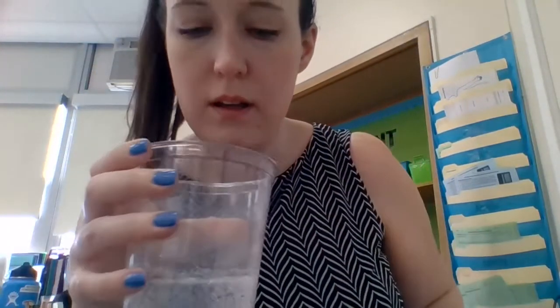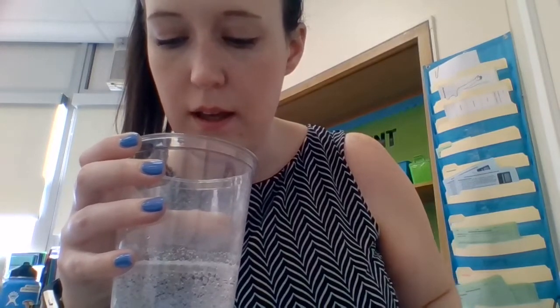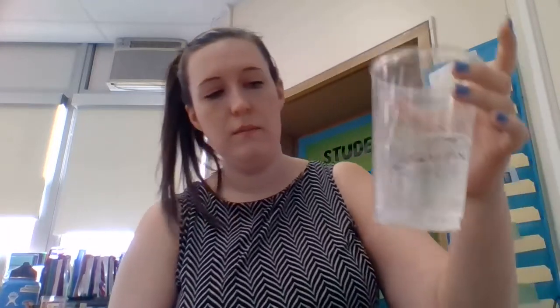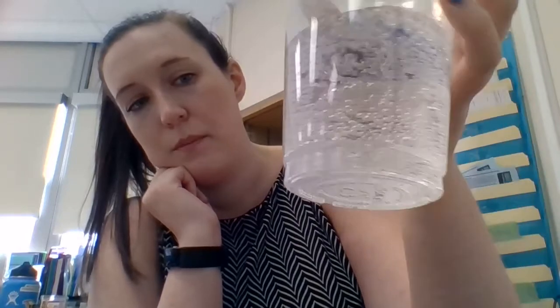And if I look, I would say it's done about now. So that was 31.07 seconds. Observations that we can make as we look, okay. There's still bubbles on the sides. The bubbles, you can compare them to the ones before. Do they look the same size, smaller, different? Are there less? Are there more?